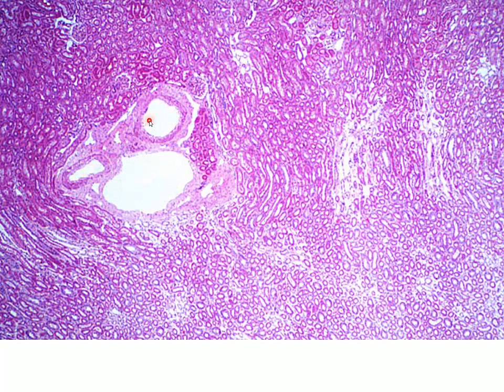We have sections through two arteries, and then we have a section through a vein. And at this junction, the juxtamedullary boundary, these are going to be arcuate vessels that are running along, following this juxtamedullary border along this curvature or this arch, hence the name arcuate arteries and arcuate veins.